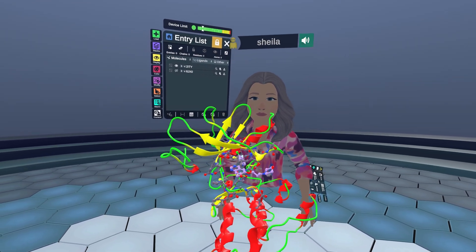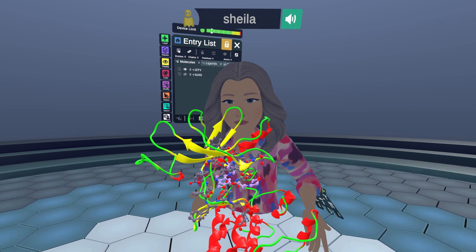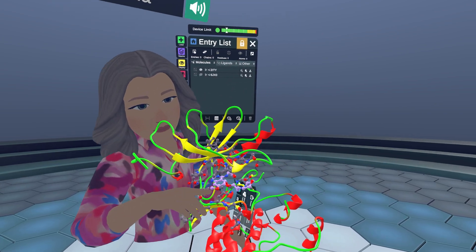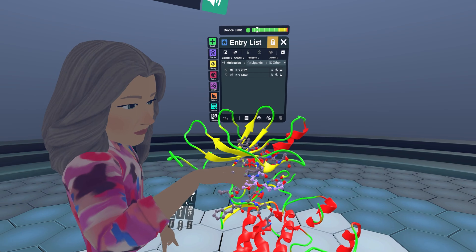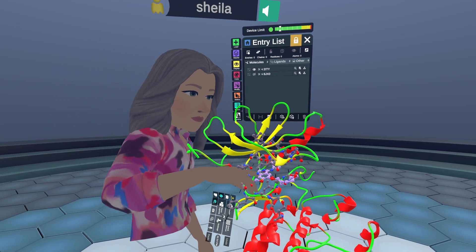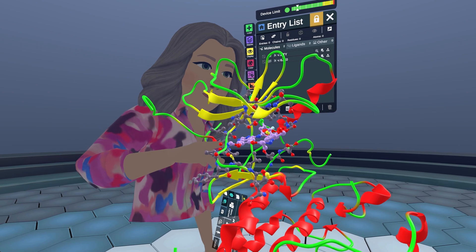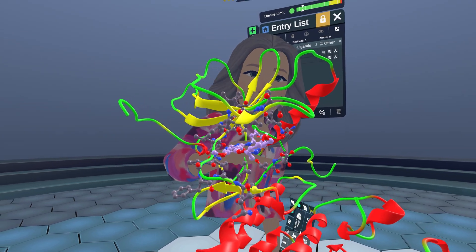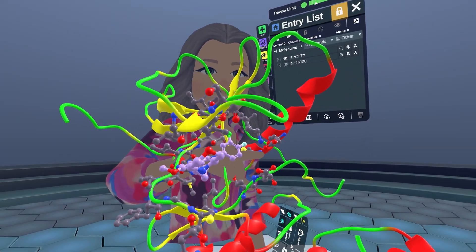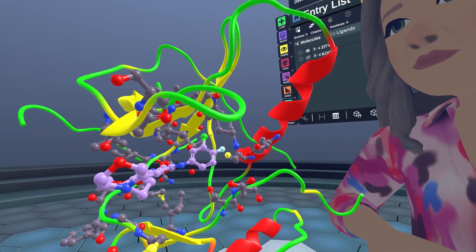Here we have a crystal structure of EGFR, a receptor tyrosine kinase, and the reversible inhibitor gefitinib bound in the active site. You can see the quinazoline ring nested here in the hinge region nicely, and this fluorochloroaromatic ring reaching into the back pocket past the threonine gatekeeper.